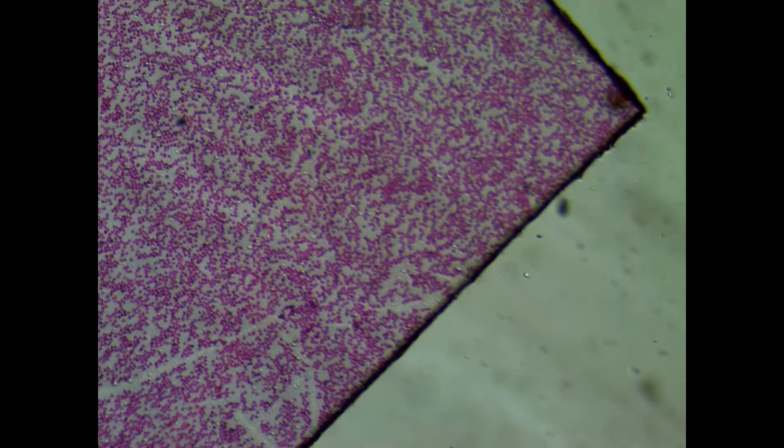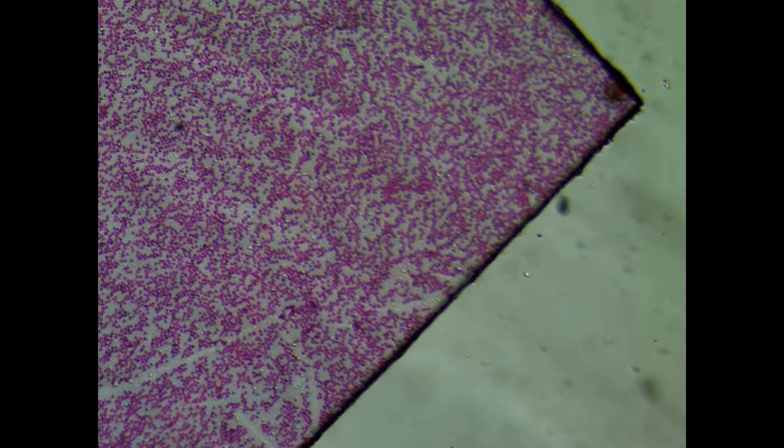Oh! Husty-gusty! That is it. There it is. Focus a little better, maybe. Oh, that's better! Okay, go back. Go back. That's good. Look! You can see all the cells. Very cool.